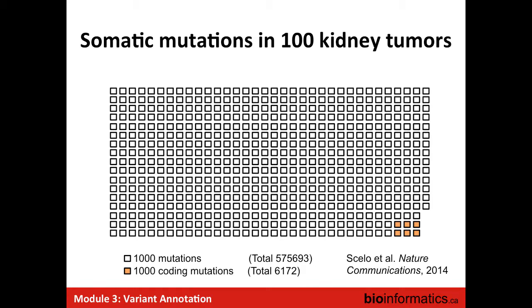It's funny, because you do the whole genome sequencing, and then in the end, most of what you use is really a very small subset of the mutations that you detect. Those are the ones that we know a little bit how to annotate, how to predict the potential impact. And that's what we'll do as well today.